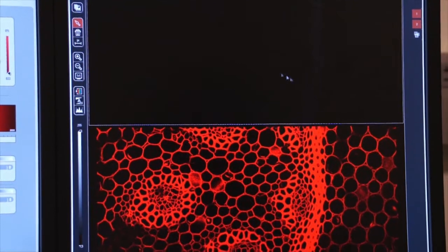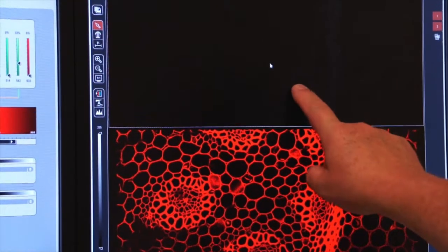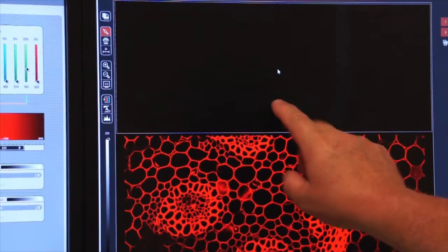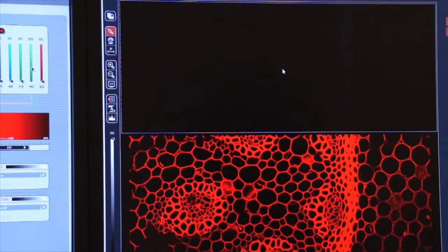Now I'm going to come up to this window and increase the sensitivity of the PMT, and you will see the illumination from our specimen over here.